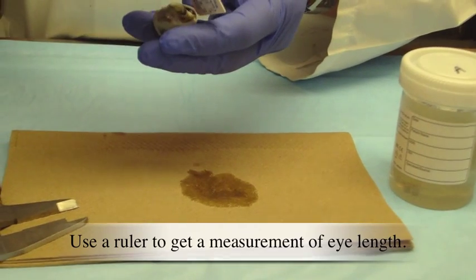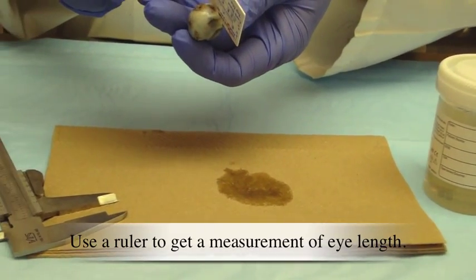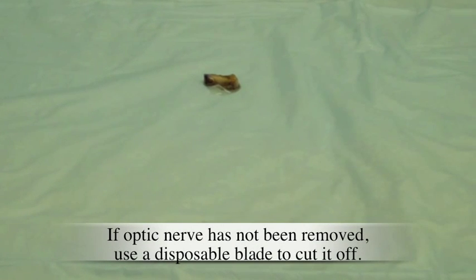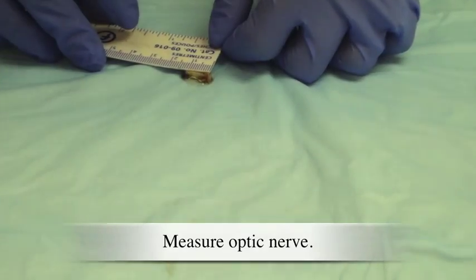Use a ruler to get a measurement of eye length. Here the optic nerve has already been removed. If the optic nerve has not been removed, use a disposable blade to cut it off and measure the optic nerve.